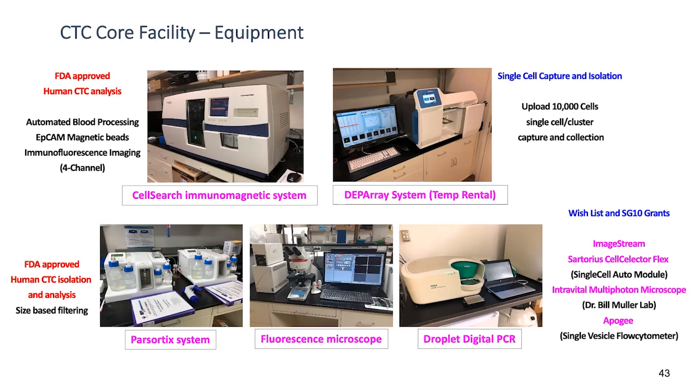And fluorescence microscope, everyone knows. Another one is ddPCR, which is a PCR cocktail. We make droplets first, then run the PCR, then analyze all the droplet signals and get the results. Whatever results we have there, maybe I'll show you later.